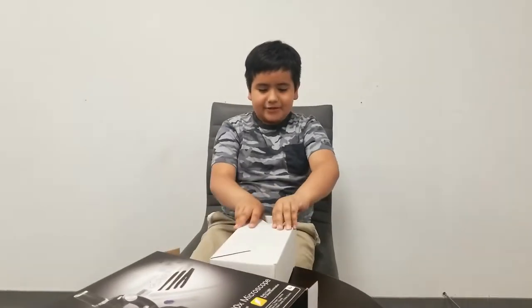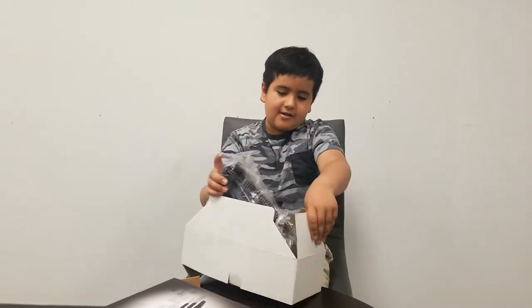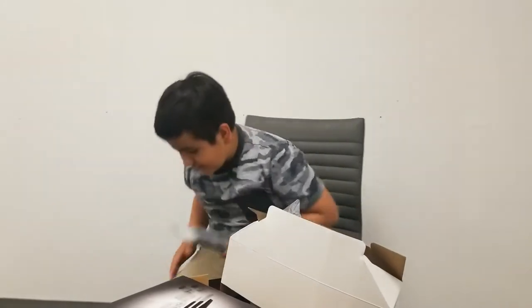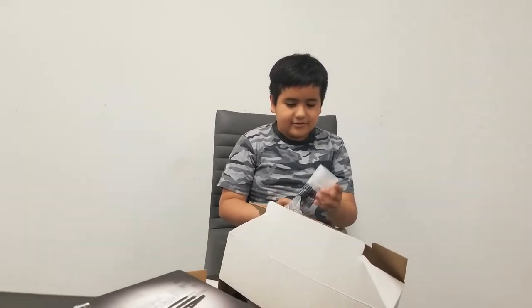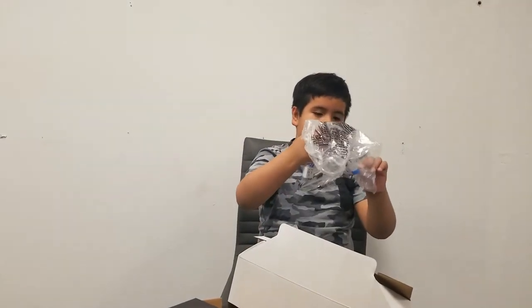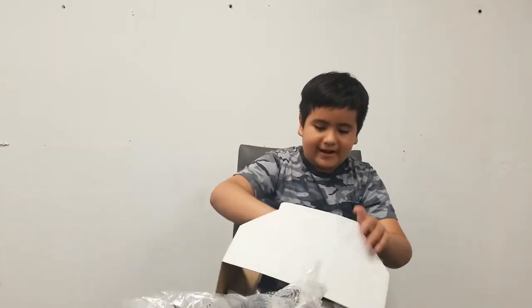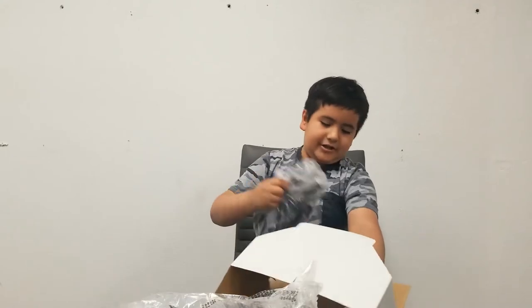Okay, so we got this box. I just dropped something and this is a little case, so let's just see what this is. In here there is also like this thing — I don't know what this is called — and a scaffold. Let's see what's in the other bags, and then we can get those boxes that are in there.